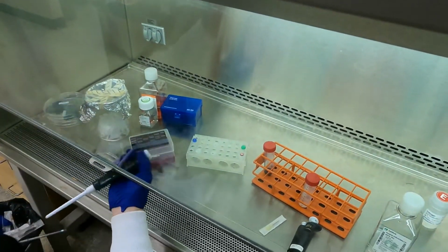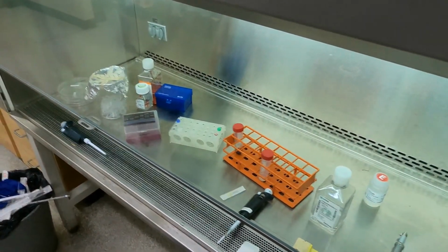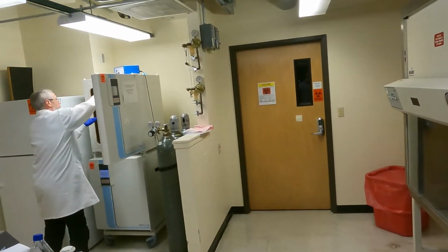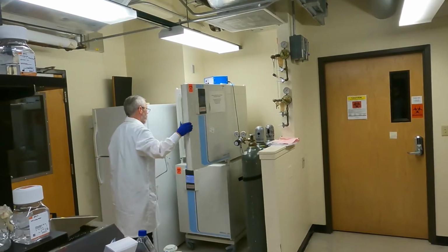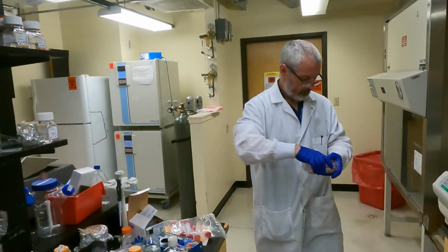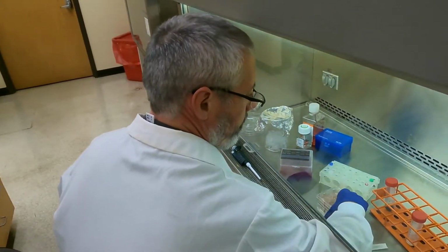Okay. Now, in the incubator, I've got some more media in place. I'm going to use this. Alright. This is going to be C16. We'll do this one first, okay?